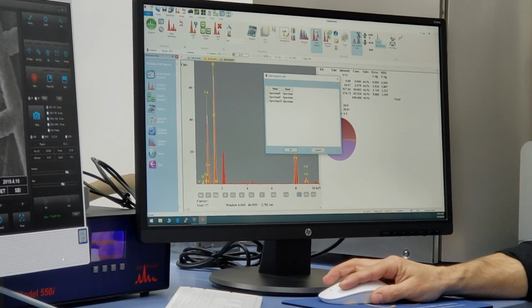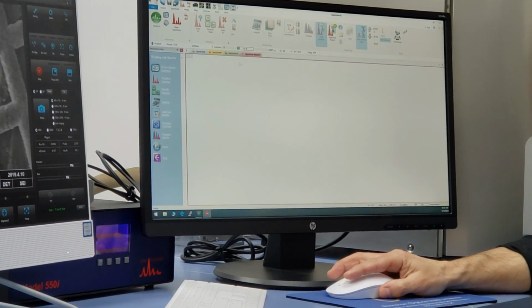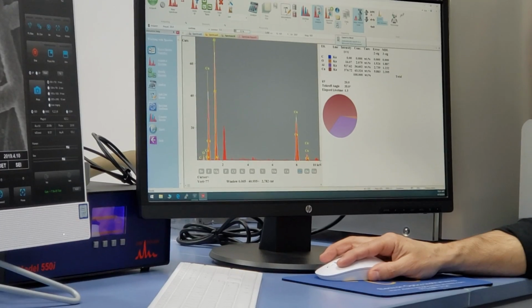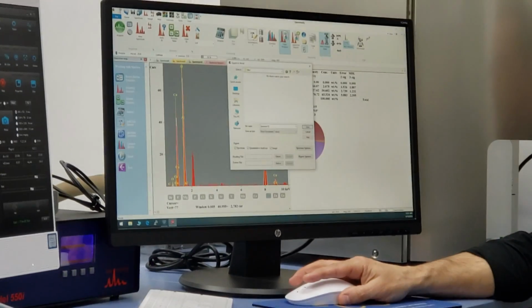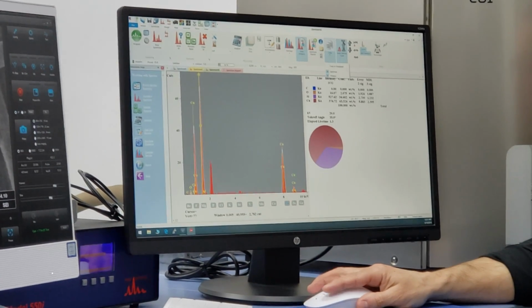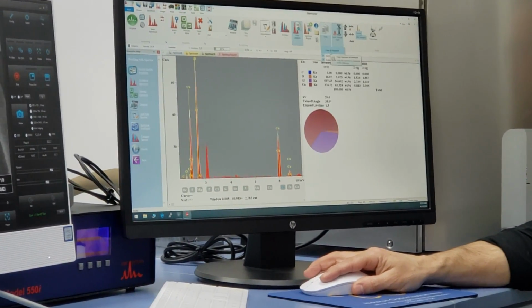That generates a spectra report, don't care for that right now. If you import the spectra report, skip it. Export to Word, so you have an export to Word doc right in there for you. And then copy paste, so if you copy as displayed, copy as displayed.